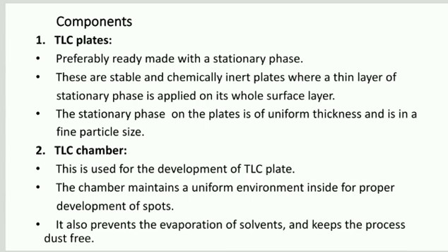Second one, TLC chamber. This is used for the development of the TLC plate. The chamber maintains a uniform environment inside for proper development of spots. It also prevents the evaporation of solvents and keeps the process dust free.